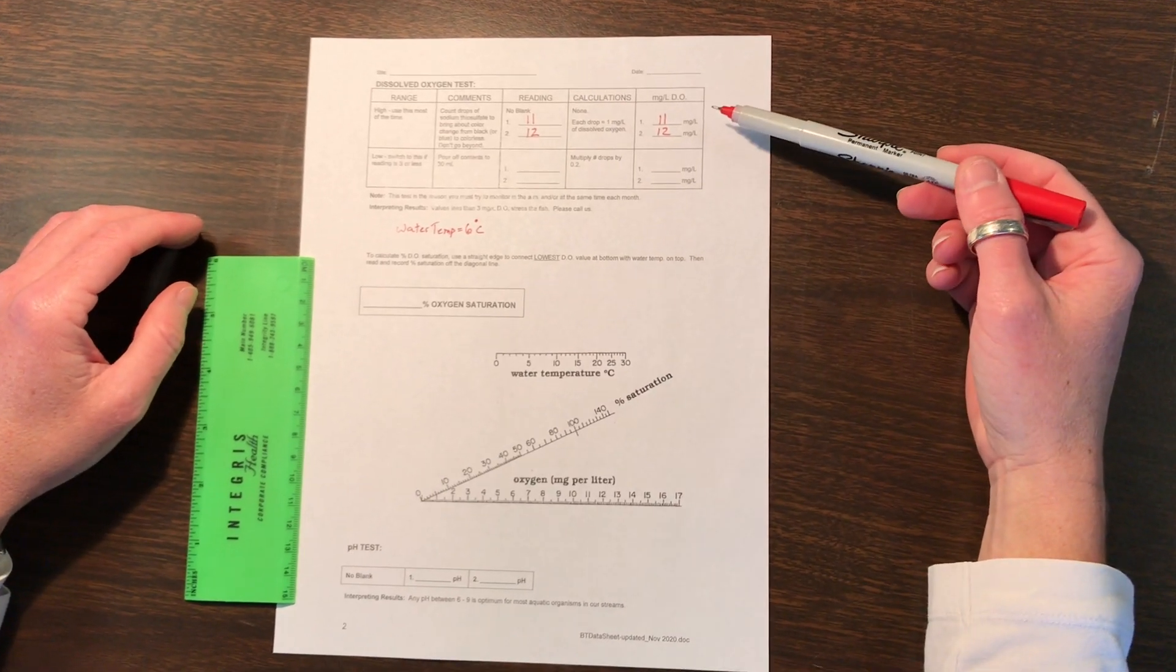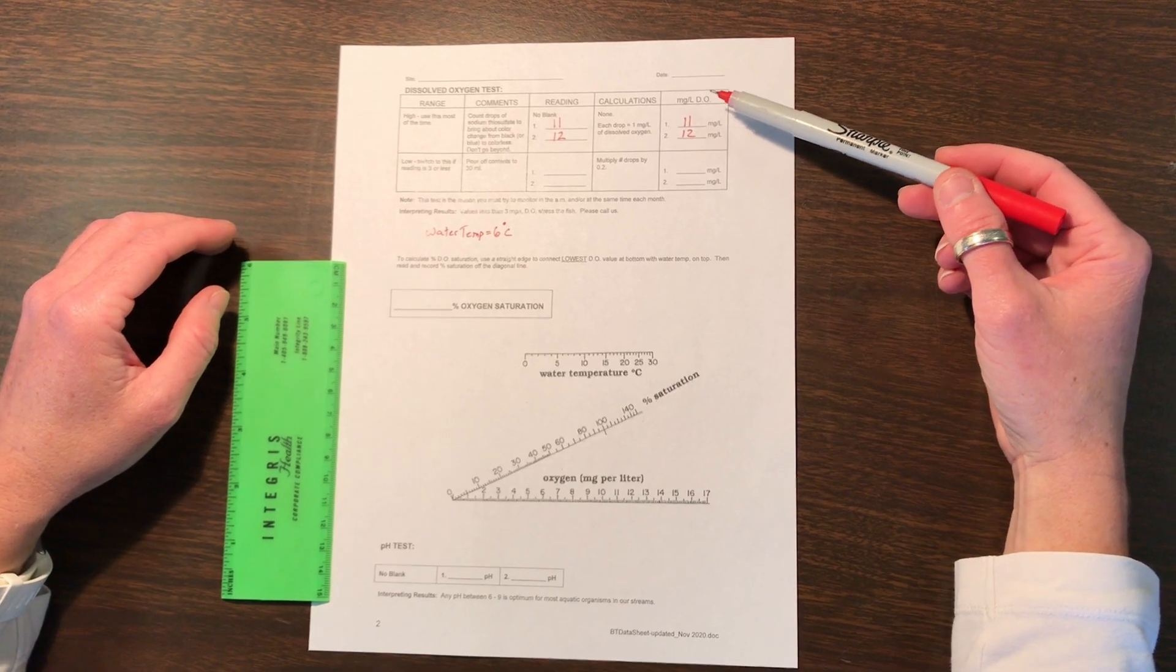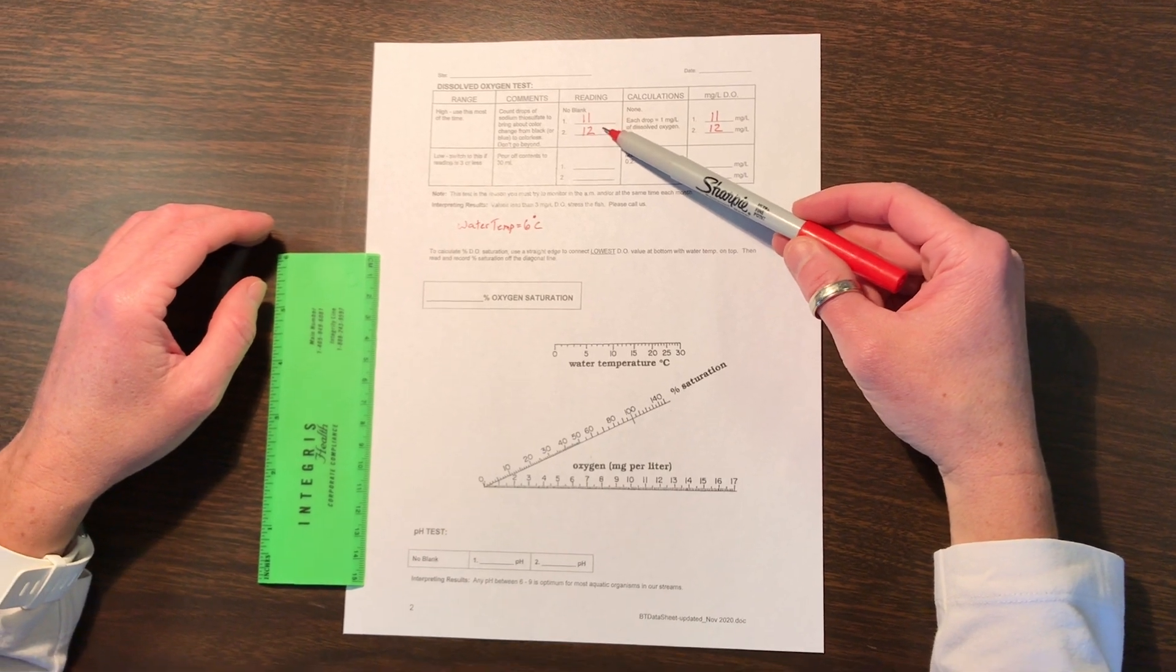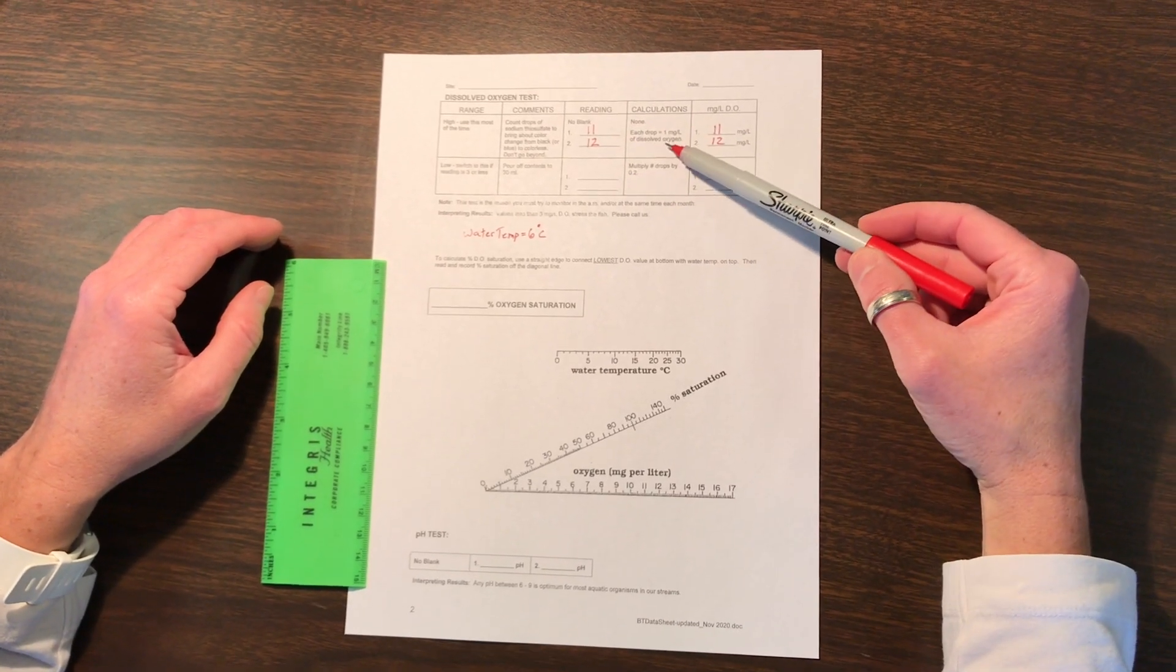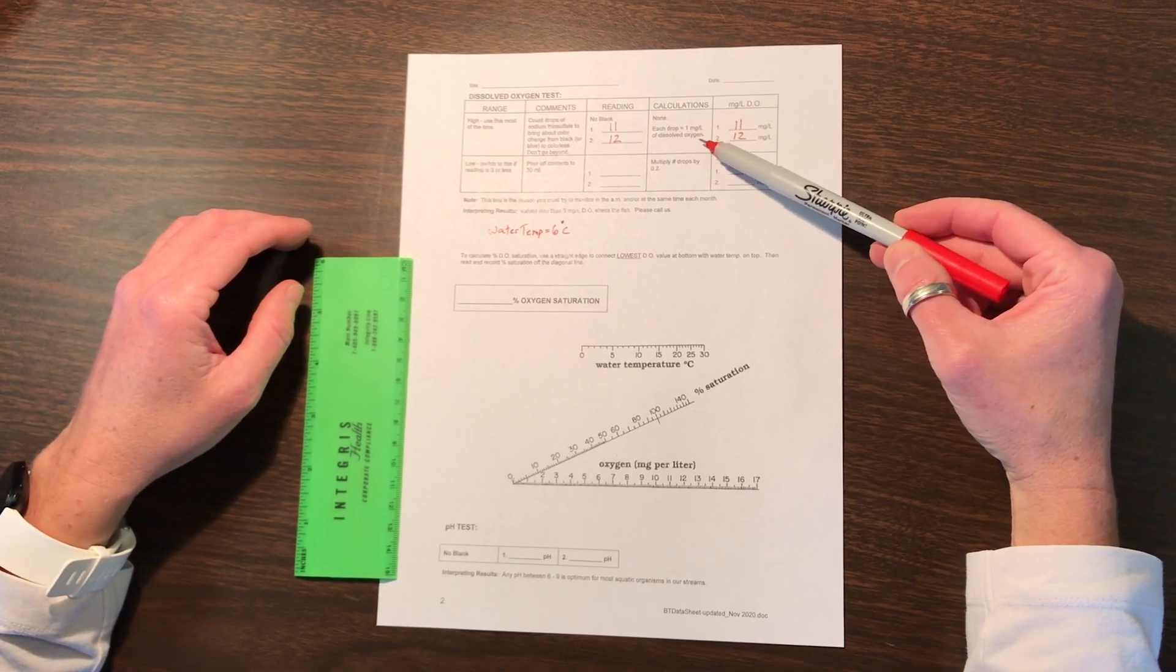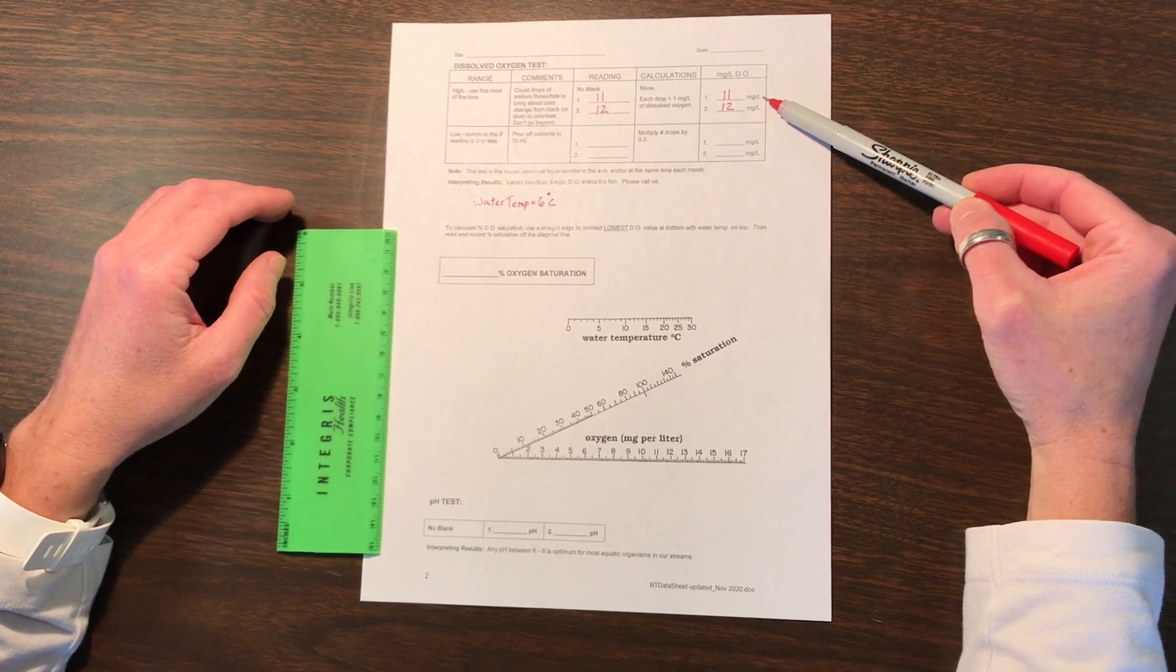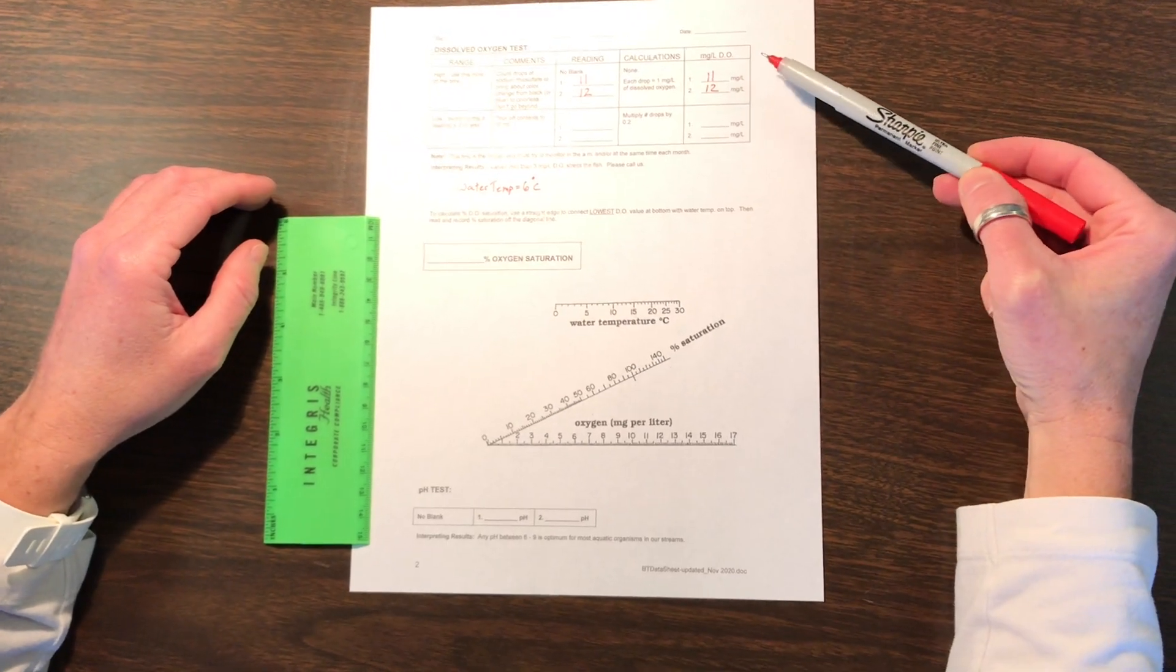Here is a scenario where we have completed our dissolved oxygen test and got results of 11 drops for the first bottle and 12 drops for the second bottle. We are doing the high range test, so each drop equals 1 mg per liter of oxygen. Hence, 11 mg per liter for the first bottle, 12 mg per liter for the second bottle.